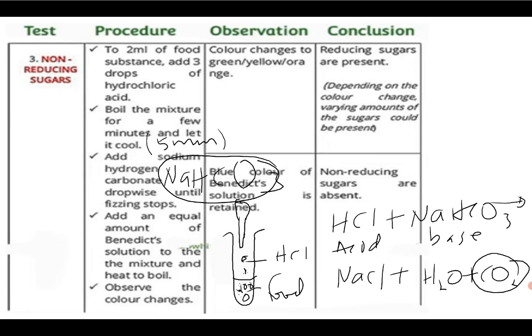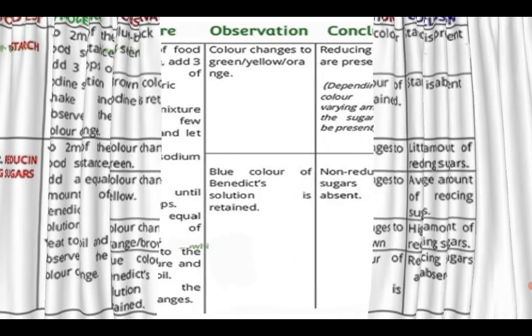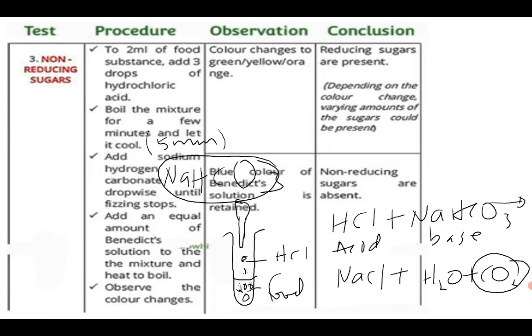So you add sodium hydrogen carbonate drop by drop until the fizzing stops.